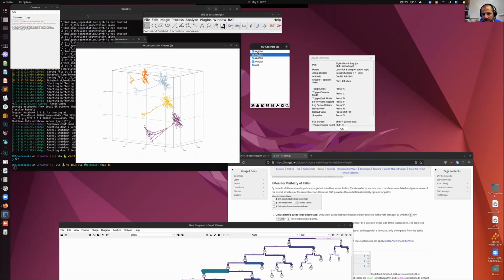You can assign tags by double-clicking on things. So, for instance, I want to say that these could be my group 1, could be red. You see that it changed the color red. It's kind of neat. You can also call these wild type cell. You can call these mutant or something, and so on.